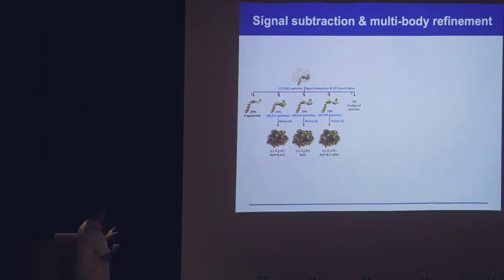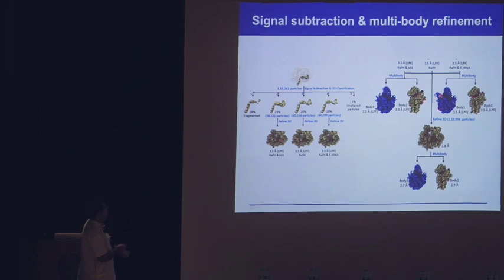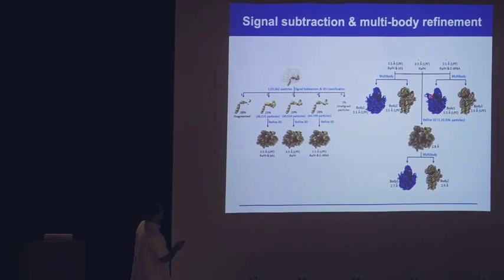What we interestingly found is in one class, this is RAF-CTD, it comes with the S1 protein. This is only RAF-CTD, this is RAF-CTD and tRNA. So we further classified, okay. Now obviously our focus is CTD, we want to add more particles. So one thing, we merged all things, so that gives CTD better resolution. And in one class only the S1 and another class only the tRNA. Okay, this way we sorted this thing.